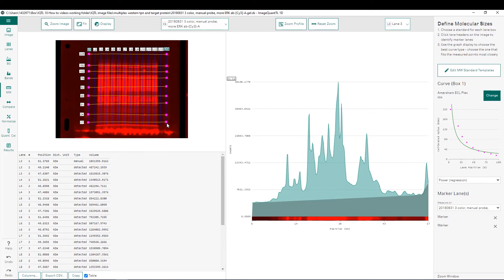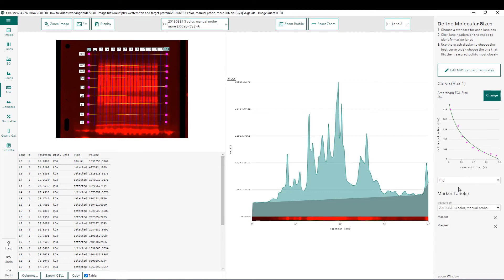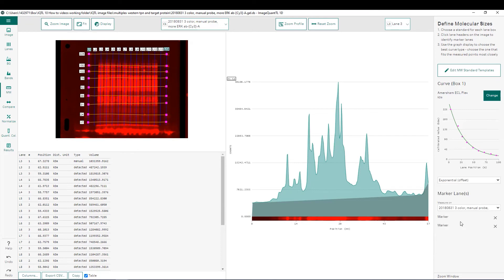Once you have all of your bands defined, we can look at the curve fit on the far right. We can see that the recommended power regression curve is not the best fit. From the pull-down menu, we have many different curve types to choose from. I typically recommend using the curve fit that best fits your data — in this case, we'll use the exponential offset. We can now see that our curve fit has been applied to all bands of interest, and the molecular weights of all bands are shown in the results window below.